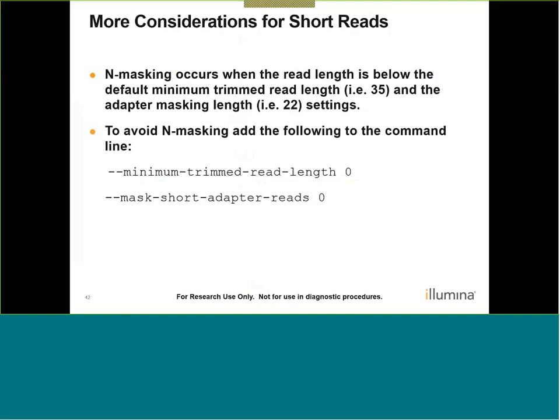Some additional considerations for short reads: if sequencing a library with short reads, such as a small RNA library with 21 bp reads, you may observe N masking in your FASTQ files. This occurs because the read length is below the default minimum trimmed read length of 35 and the adapter masking length of 22. To avoid this, include two commands to set the minimum trimmed read length and mask short adapter reads to lower values — in this case, specifying zero ensures no N masking is performed regardless of sequence length.